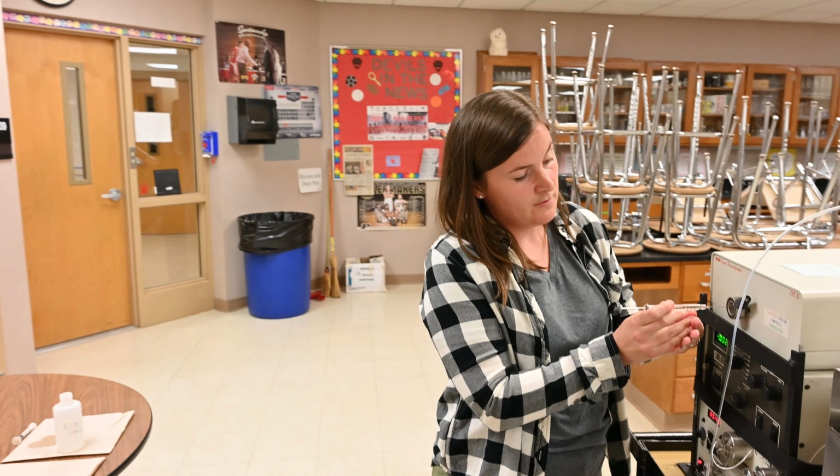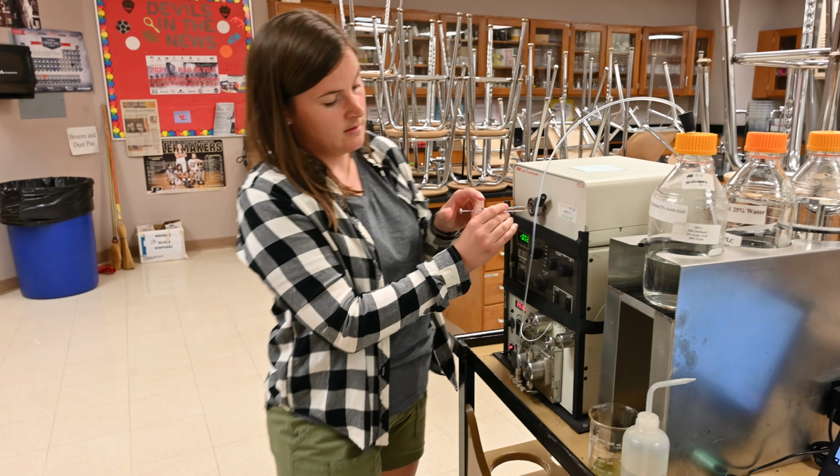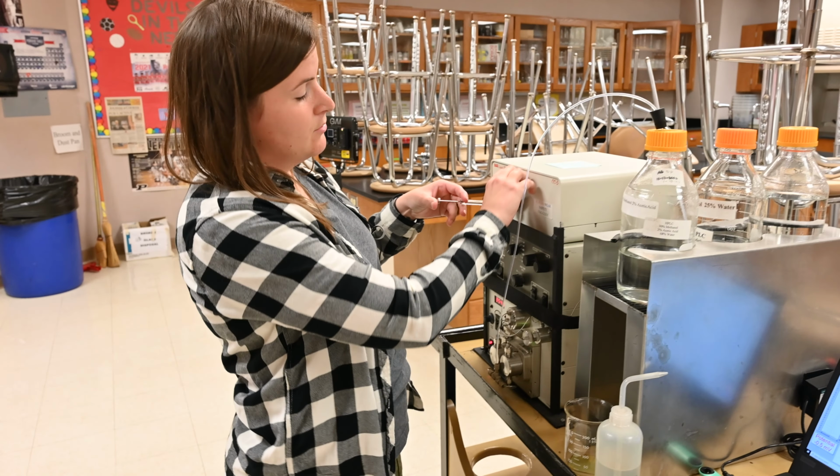I bring my syringe over here. I inject it as I'm ready to inject. So what you're gonna see as you are watching the screen here is a red line going along the bottom. And this is just basically that mobile phase hitting the detector.